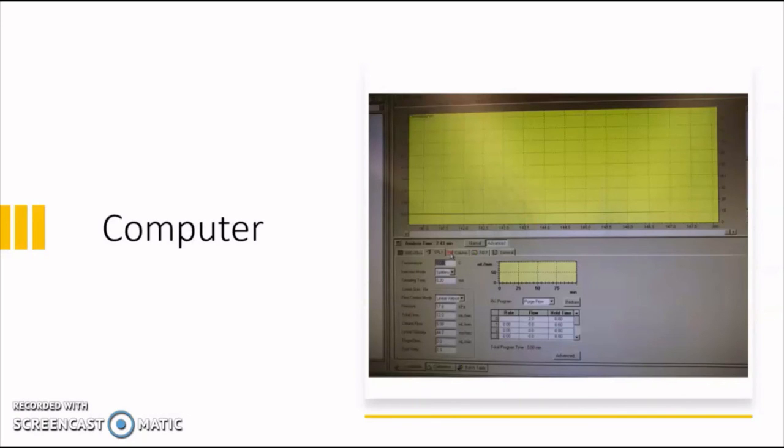The final component of any chromatography system is the computer and its integration software. The computer is responsible for maintaining communication between each part of the instrument. For each analytical method, there is a subprogram that controls the autosampler and injector, the flow and mixture of gases, the column and oven, and the detector. The integration software is responsible for performing the complex calculations that produce our testing results.